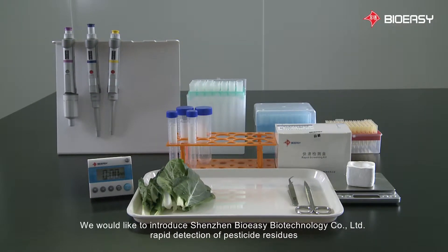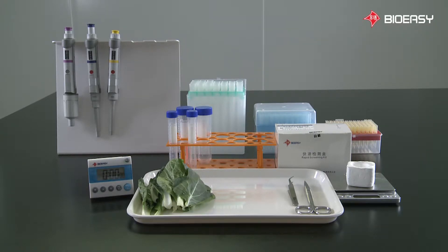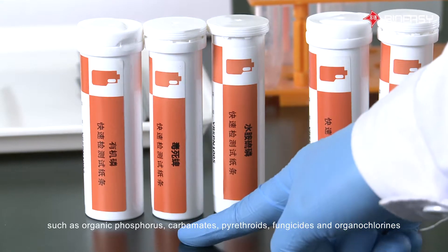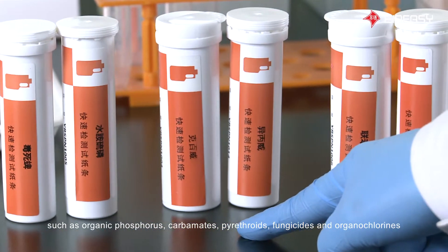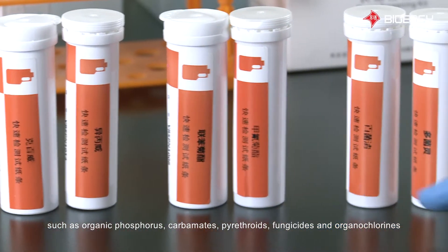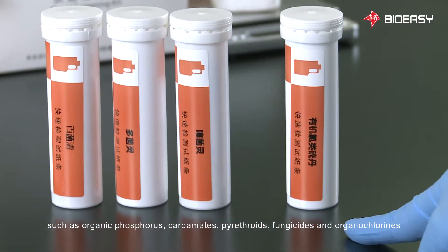We would like to introduce Shenzhen BioEasy Biotechnology Company Limited Rapid Detection of Pesticide Residues. This detection method is based on Colloidal Gold Immunochromatographic assay. Using this test kit, we will be able to detect pesticide residues such as organic phosphorus, carbamates, pyrethroids, fungicides, and organochlorines.